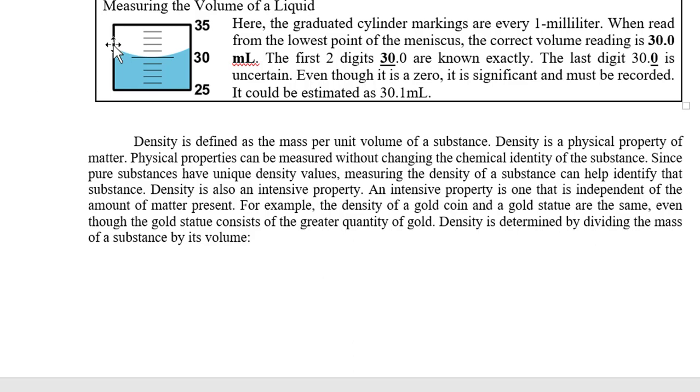So we can see that in this drawing. We're showing how the liquid will curve down. So there's an upper edge where it's curving up to the edge of the container, and then it's also curving down to the bottom in the middle. So we need to have a consistent way of making this measurement, and the way we do this is we measure from the bottom. So we measure the volume of a liquid by measuring from the bottom of the meniscus.